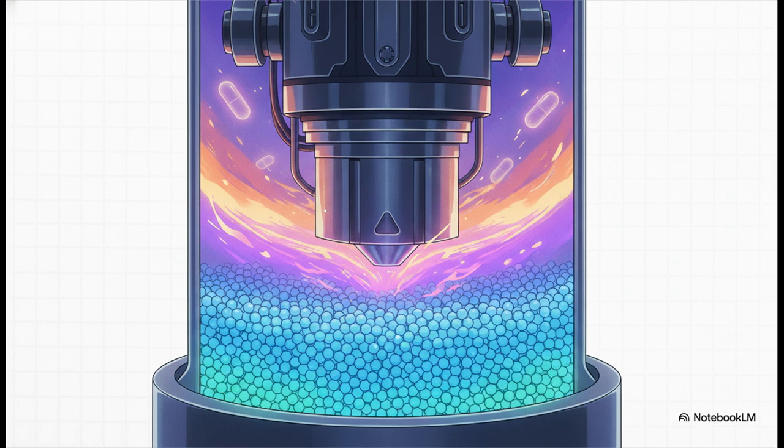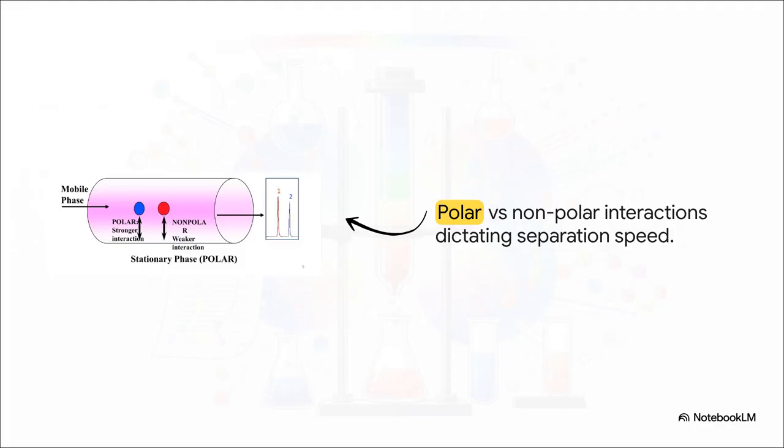No way. We have to use incredibly high-pressure pumps to literally force the liquid mobile phase through the column. And that intense pressure is exactly what gives us the high performance, letting us analyze really complex liquid samples like delicate medicines with just incredible precision. Now, what's really interesting here is looking at what's actually happening inside that high-pressure column.